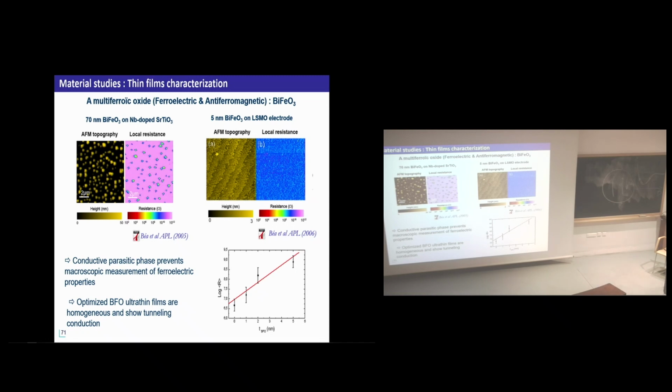Yes. Question: if we are showing a scanning current, does it make sense to call it resistance? You just plot at a constant bias. Yes, you're right. It's exactly just a convention. This is what you're looking for. Of course, if the IVs are highly nonlinear, you won't get your exponential dependence. You're right.